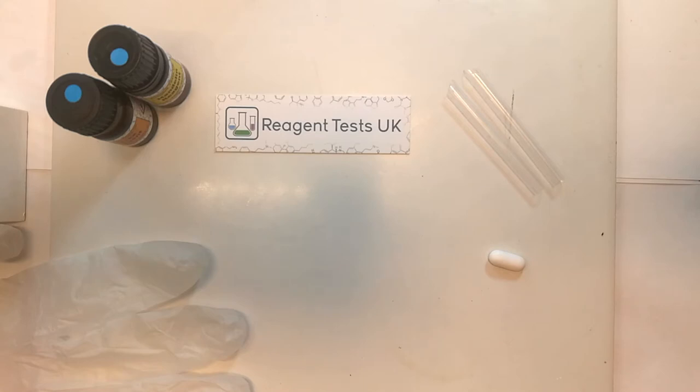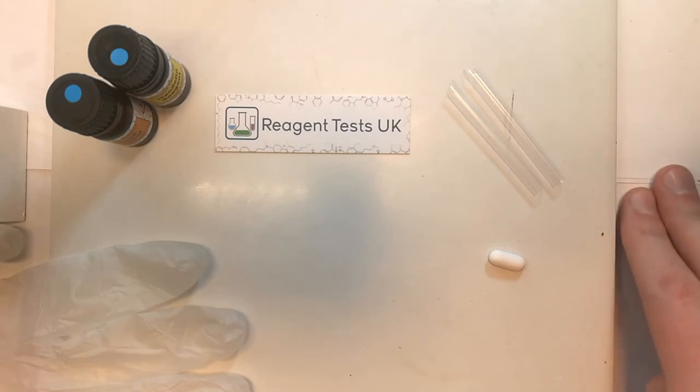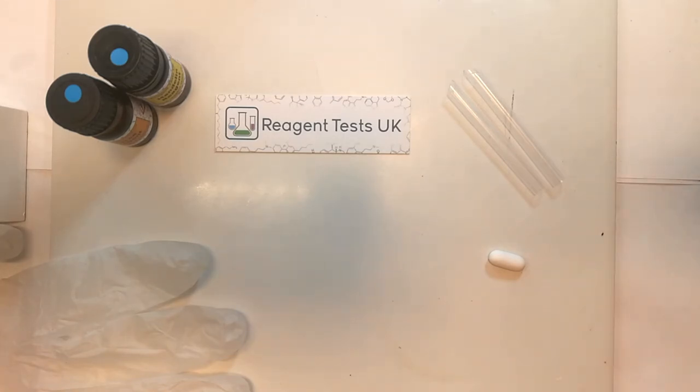So it's important to make sure that you've put a covering down on the table that you're working on — this can be plastic, paper, anything that you're not worried about if it were to get stained.